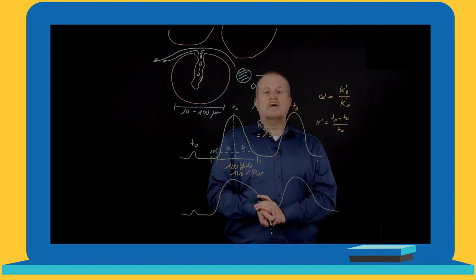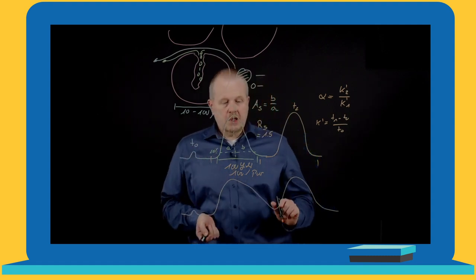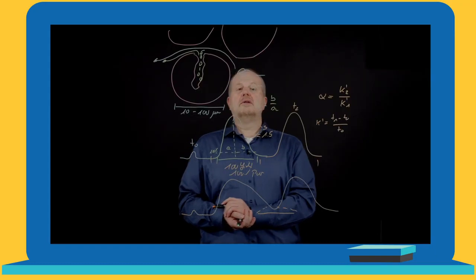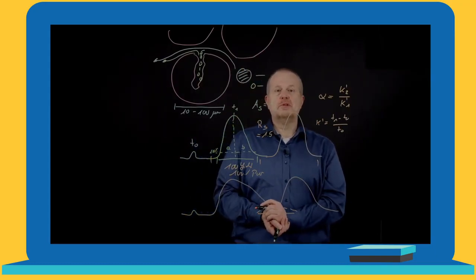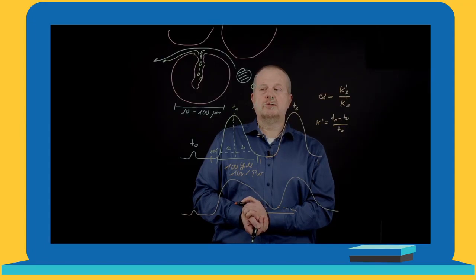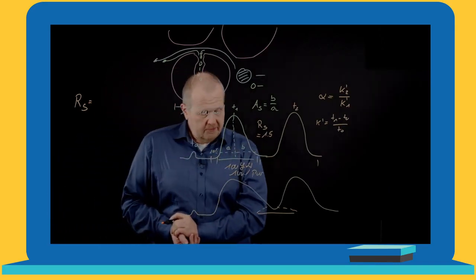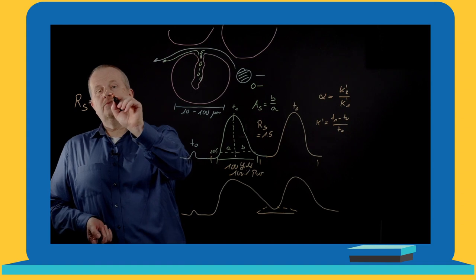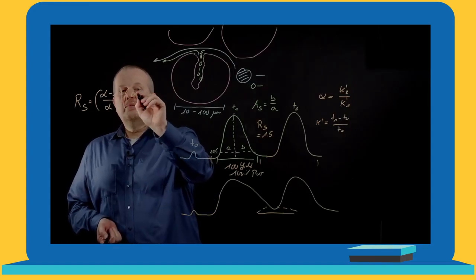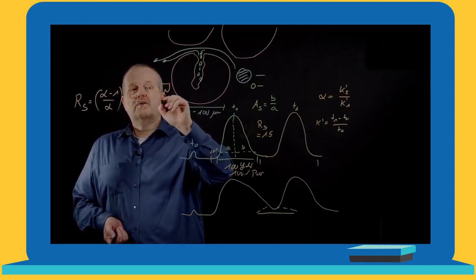The optimization of resolution is the most important point in preparative chromatography, because we do not want these overlapping areas where we don't have sufficient purity, so we have to cut fractions and we lose yield. Because of that, we will now optimize our resolution. The equation for resolution has three main factors. The first one is related to alpha, the selectivity. The second term is related to K', and the third term takes into account the efficiency.